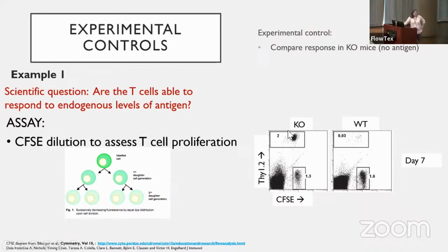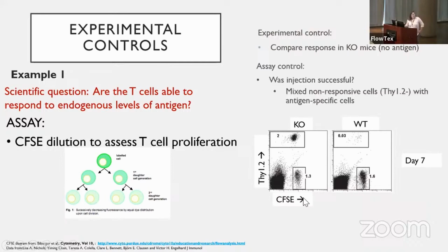But they have this other marker which should identify them. I don't see them all. Anybody else see them? But I have an experimental control, an assay control that basically says, well, maybe I missed the mouse when I stuck the cells in it, right? Maybe I just missed. Well, I have this internal control. This is an assay control. You guys need to build these into your experiments.